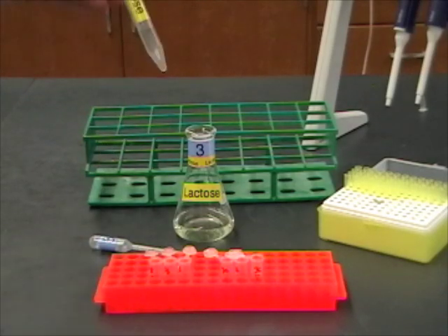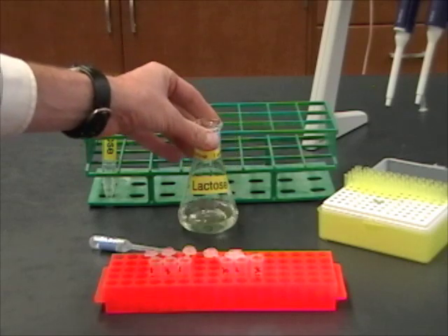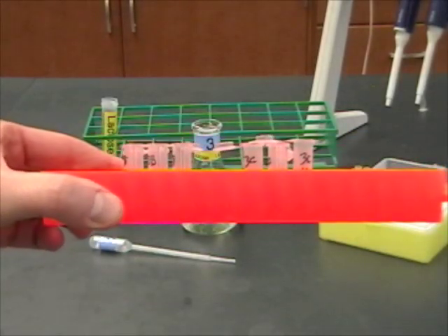I've got my sugar measured out and I've got my 27 milliliters of bacteria ready to go, but I still have to label the tubes that I'm going to need, because you have to do this at the start — once the reactions get going, you won't have time to get this all done.